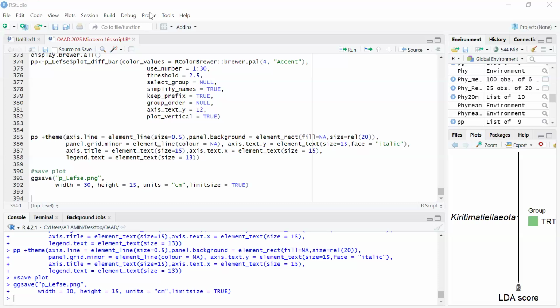It runs on Linux, not Windows, or if you use Windows, you need to use a VirtualBox. Or you will use DADA2 to give you ASV, or you will use QIIME 1 or 2 to give you OTU.